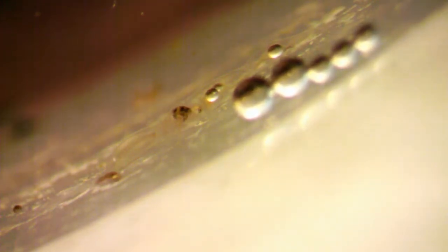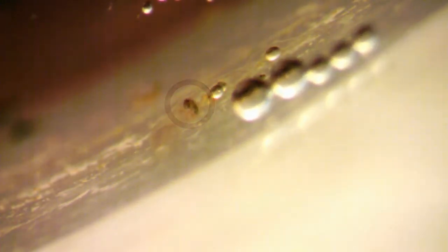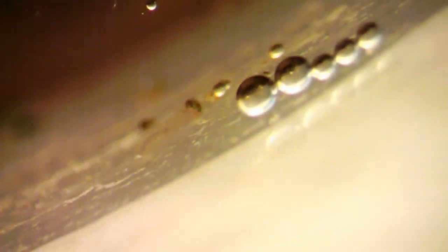So far, we've talked about the very bottom of the food chain and covered some middle ground, herbivores like ostracods and omnivores like copepods. But we haven't truly seen the top predators in this microscopic world. At least, not yet. This is a diaphanous worm, a gossamer thin hunter that searches for movement by inching along and exploring with its head. By now, we're probably used to seeing organs through clear microorganism bodies, but this worm actually doesn't have any pigmented ones. Instead, we see other organisms, including an ostracod and small copepod, which have been caught and are now being digested. And the diaphanous worm isn't the only predator around.